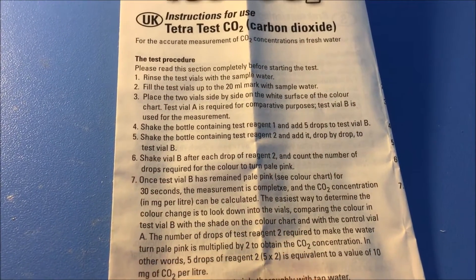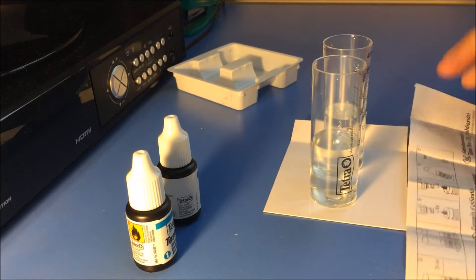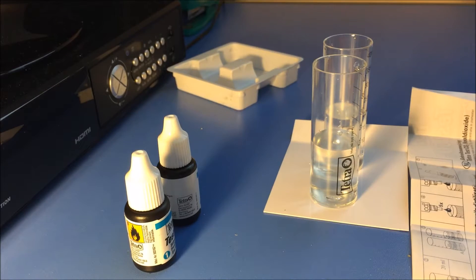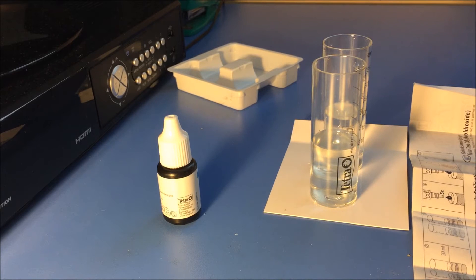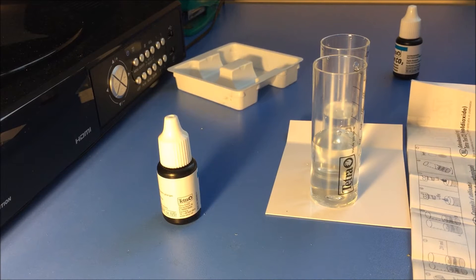I'm going to shake the bottle containing test reagent one and add five drops to test vial B — this one on the right. One, two, three, four, five — done.